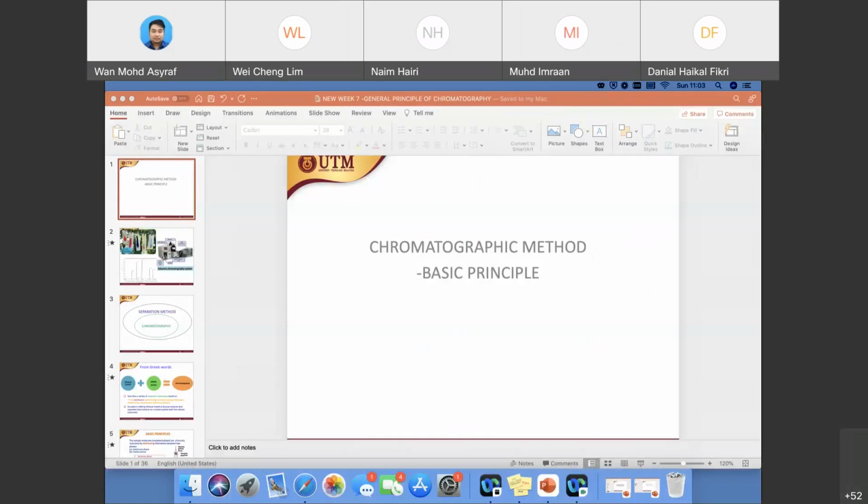And then you have also looked into how to prep the sample for inorganic analytes, and then on the validation part for the spectroscopic analysis. All right, so basically whatever we have learned before for spectroscopic instruments is usually for inorganic analytes, okay?